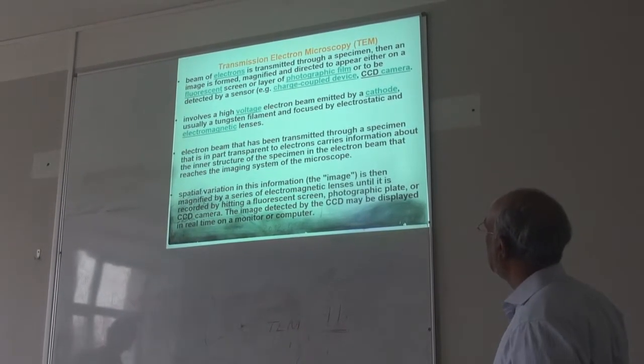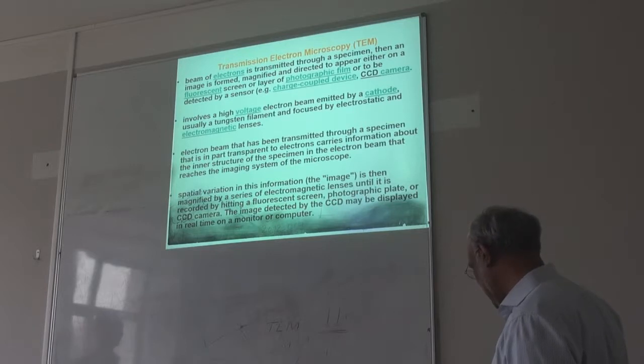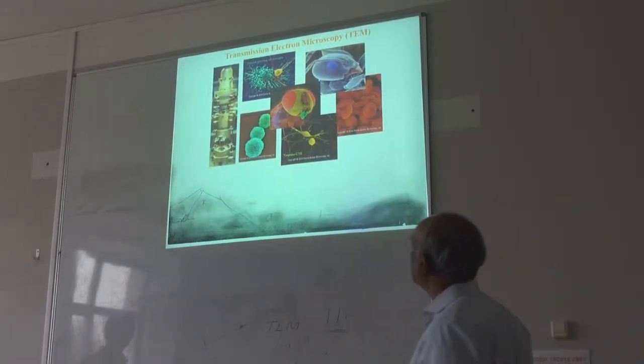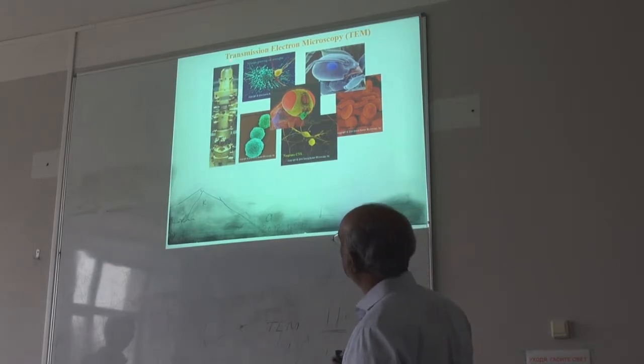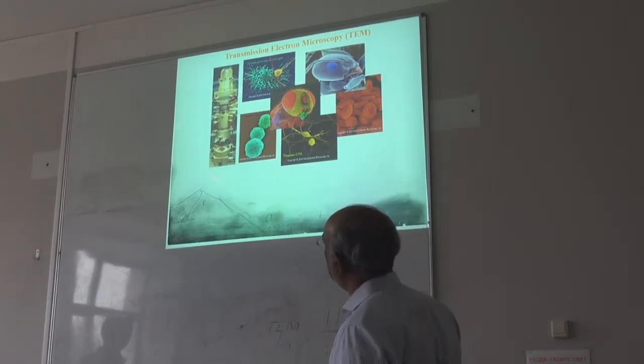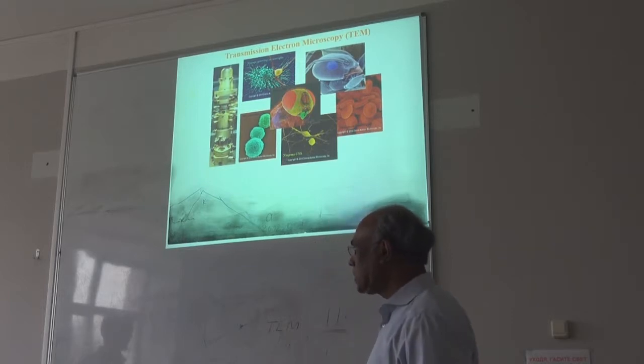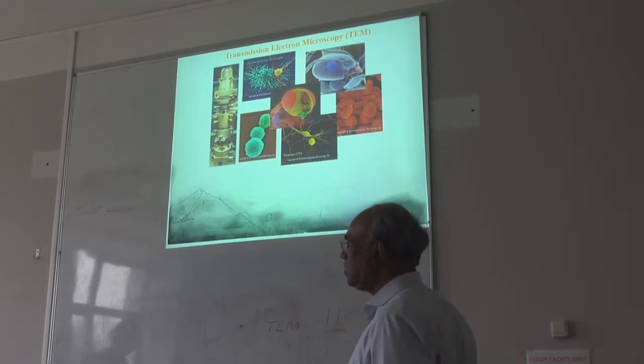So these are some details. I don't think I have to go through that. This is a typical transmission electron microscope. Do you have one here on this campus? We have one in our materials department. No. It looks like this.